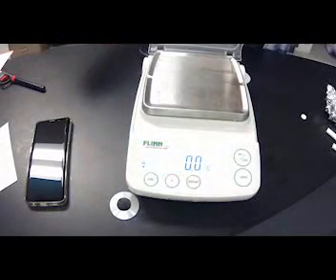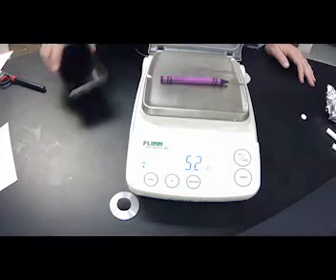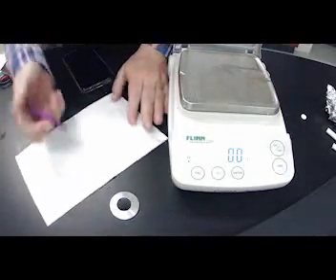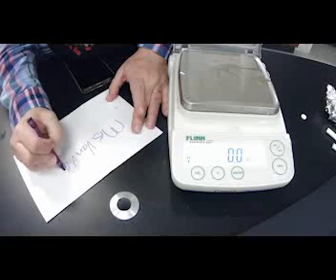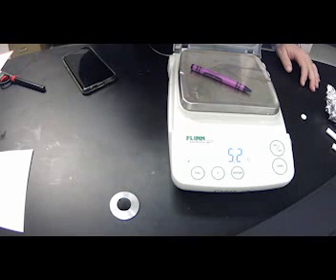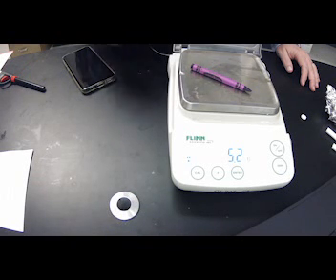All right, for the crayon, we're going to go ahead and weigh it before. It is 5.2 grams. I have my paper here, I'm going to go ahead and I'm going to write my name in my wonderful handwriting, and I'm going to write my full name. Woo, with a little bit. And then I'm going to weigh it again. And it is now 5.2 grams. Okay. And so now you're going to answer A, B, and C for the crayon.